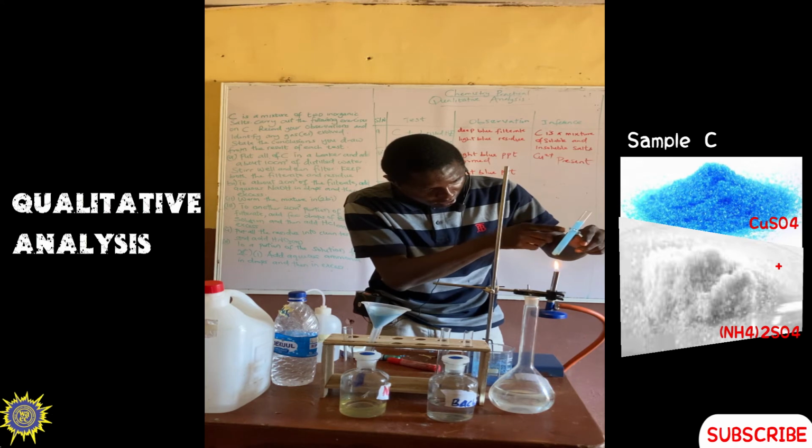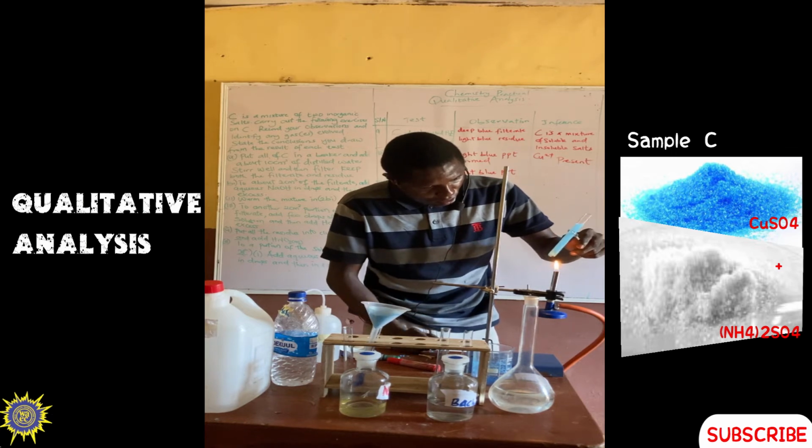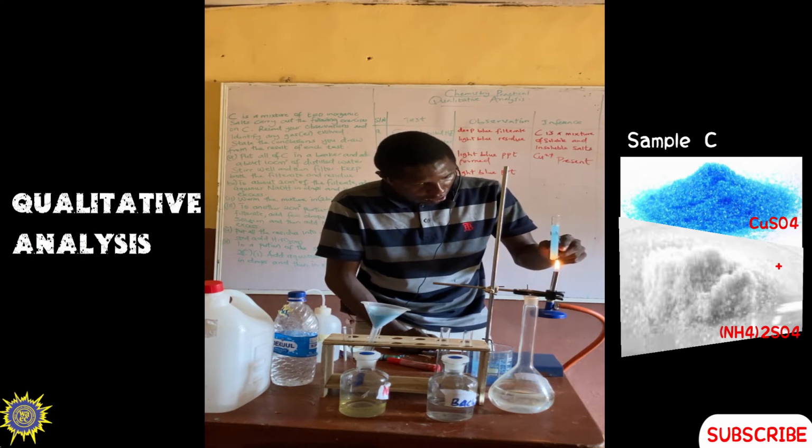The blue thing is changing gradually. With time, it will change to black. We have to warm it, not to eat it. I just want you to see black before I take it off.